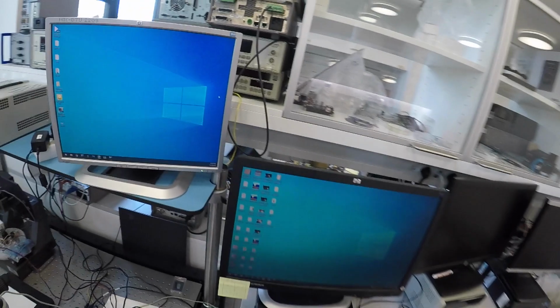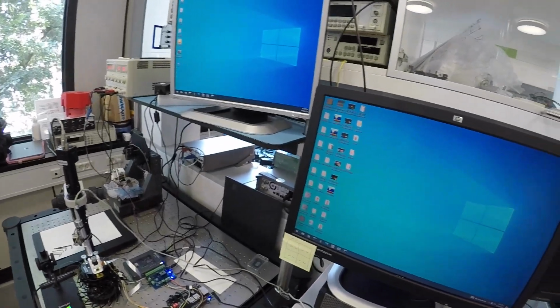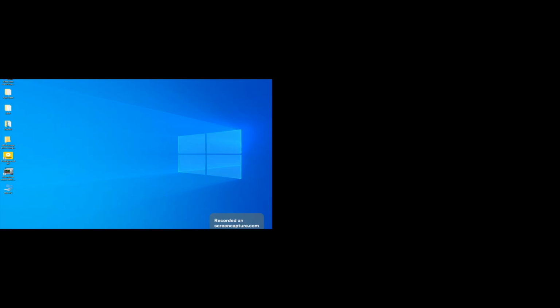Now we have two screens, and I normally divide the two screens into having my left screen as my camera towards the cantilever. You can do it a bit better in graphic. Here we put in the settings, and then you can zoom directly on the camera. Then you can see that it is far from the sample when you need to take off the lid.